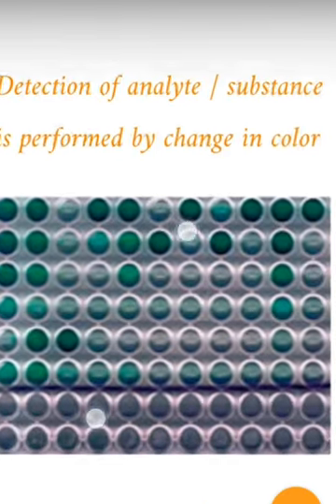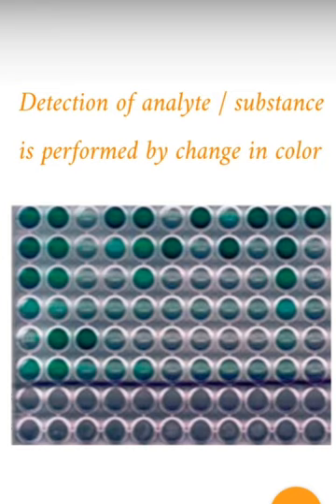Next, this is how your microplate looks when it gives results. The results will be colorful.